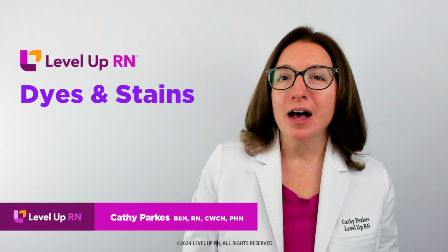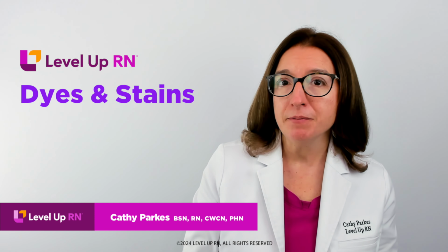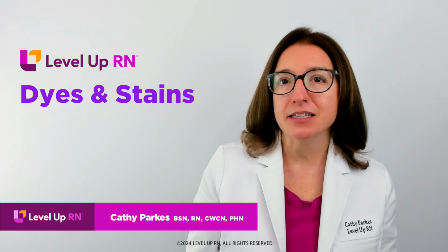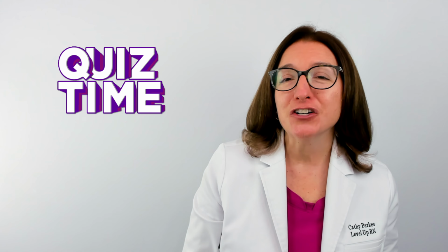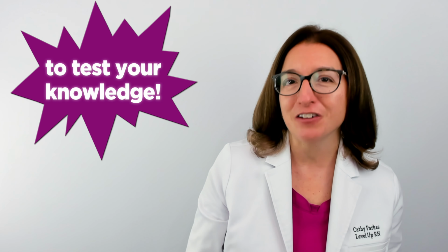In this video, I will be discussing how to prepare a specimen for light microscopy, and I will also be discussing common dyes and stains used in microbiology. At the end of the video, I'm going to give you guys a quiz to test your understanding of some of the key facts I'll be covering, so definitely stay tuned for that.